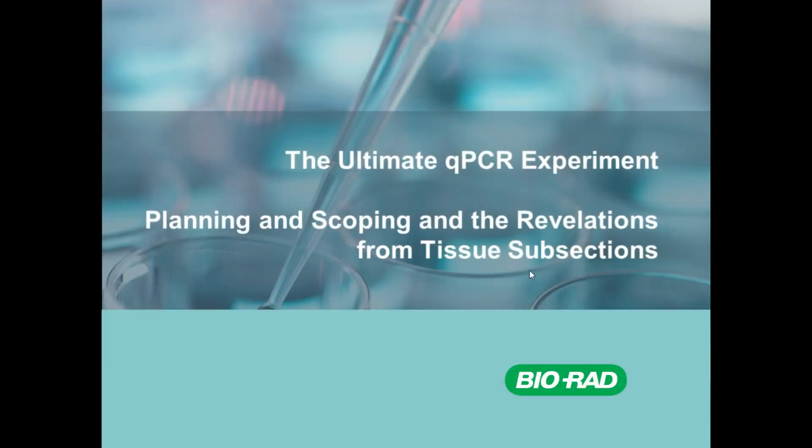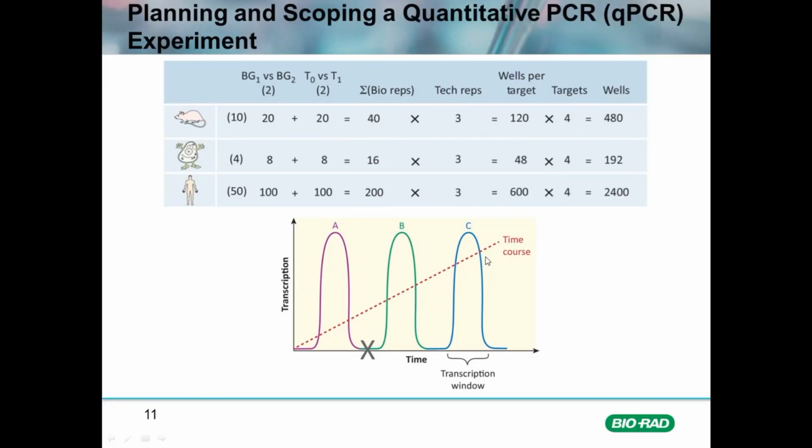The first video in the Ultimate qPCR Experiment series describes how to plan and scope a qPCR experiment and describes the revelations from tissue subsections. The beginning of any experiment, including a qPCR experiment, is the planning phase.